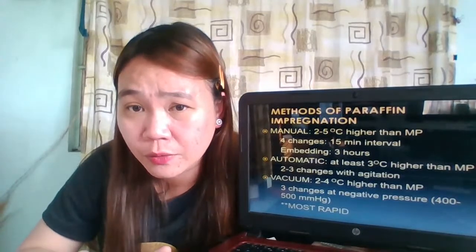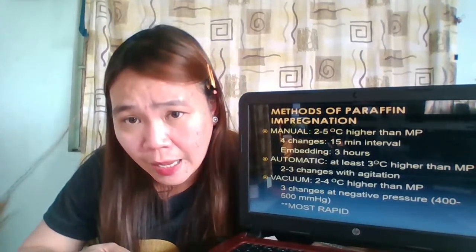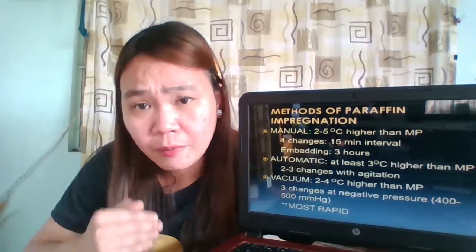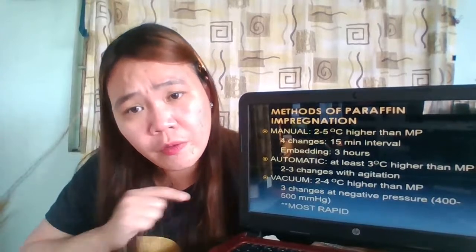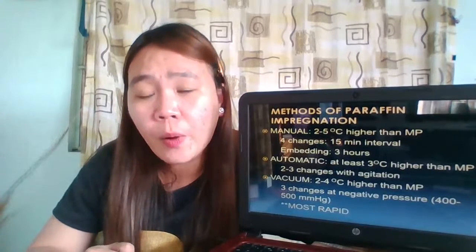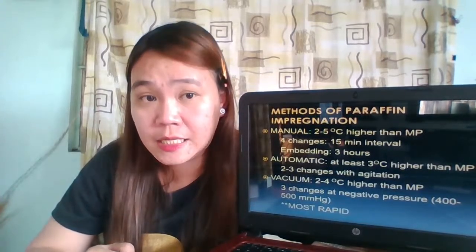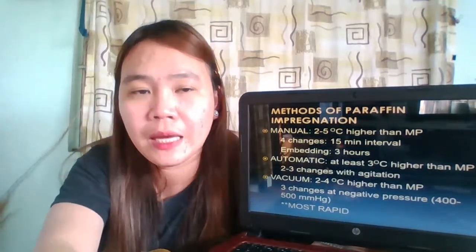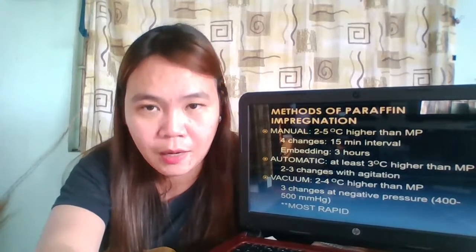In paraffin impregnation, the minimum requirement is 2 changes. But if you are performing paraffin impregnation manually, the required number of changes would be 4, and embedding is performed for 3 hours. That is complete embedding.